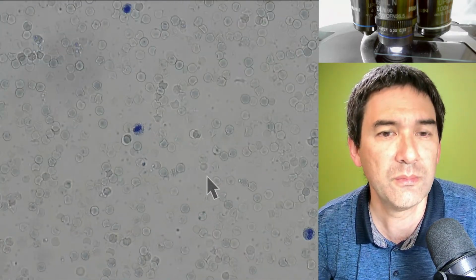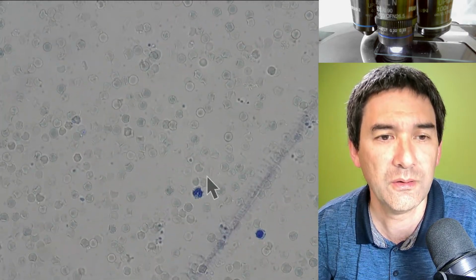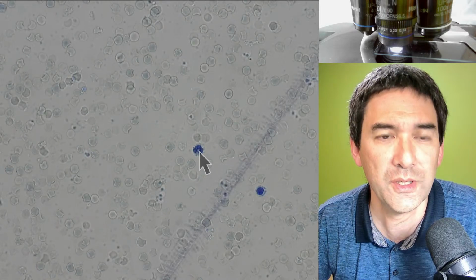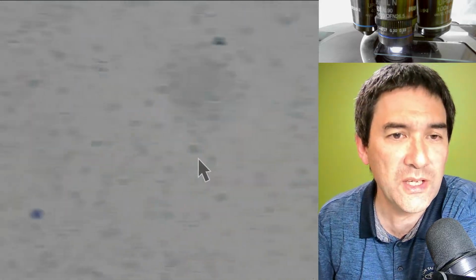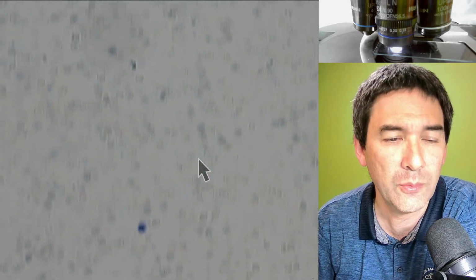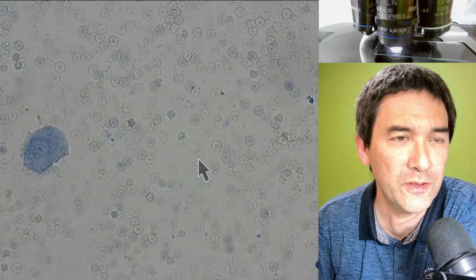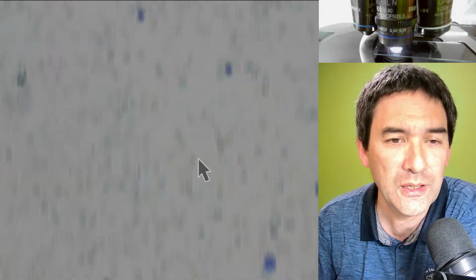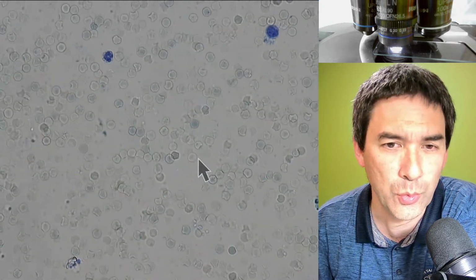So that is something here again quite nicely visible. Here again, multiple lobes. It's interesting to see that with relatively simple techniques you're able to make the white blood cells visible. Again, methylene blue I think is not the standard one that you use. There are different stains which are more commonly established for blood microscopy, but in my case it worked well.